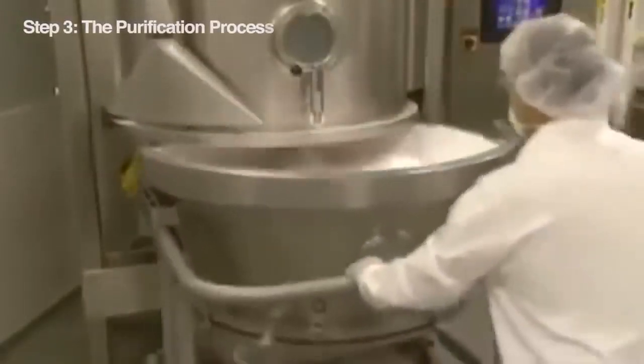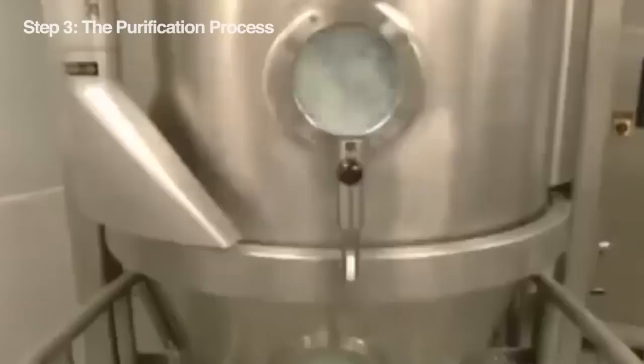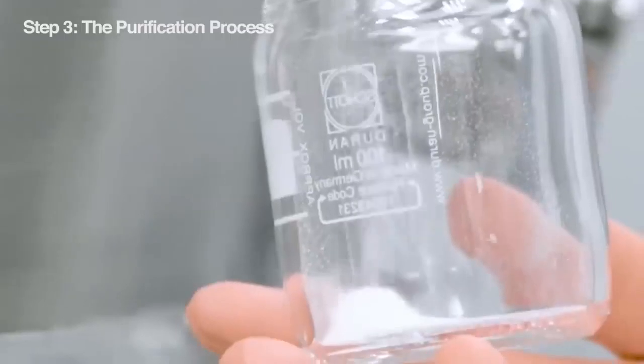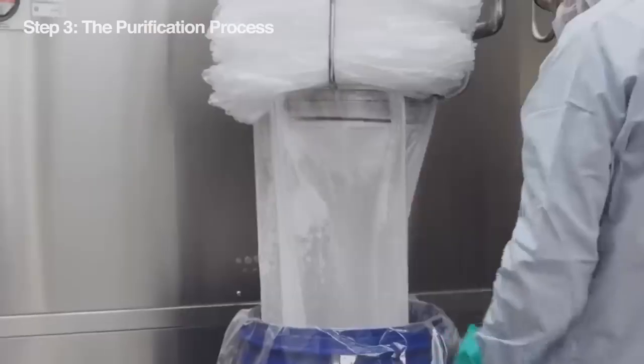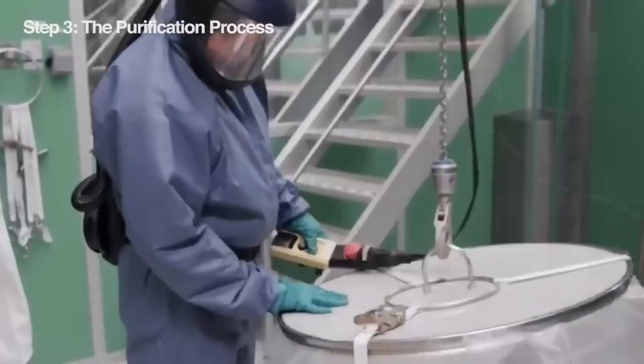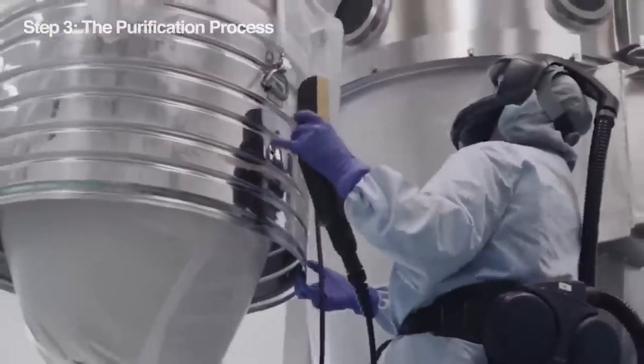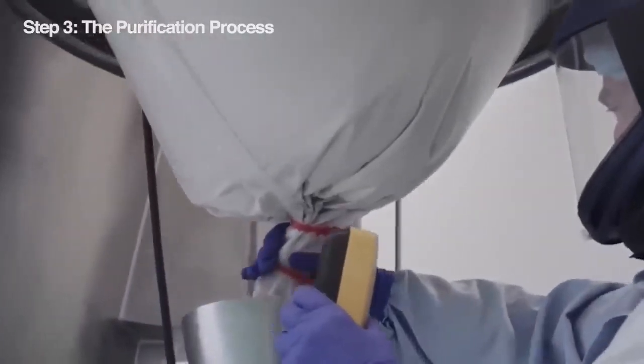Alright, so we've mixed our amazing ingredients and watched the chemical reaction create something awesome. But the aspirin isn't quite ready for use yet. It's still a bit rough around the edges, with some unwanted impurities clinging on. We need to separate the good stuff from the not so good stuff, a process called crystallization. We use a special solvent, like water or ethanol, to dissolve everything. Then we crank up the heat a little, helping all that gunk separate from the good stuff.